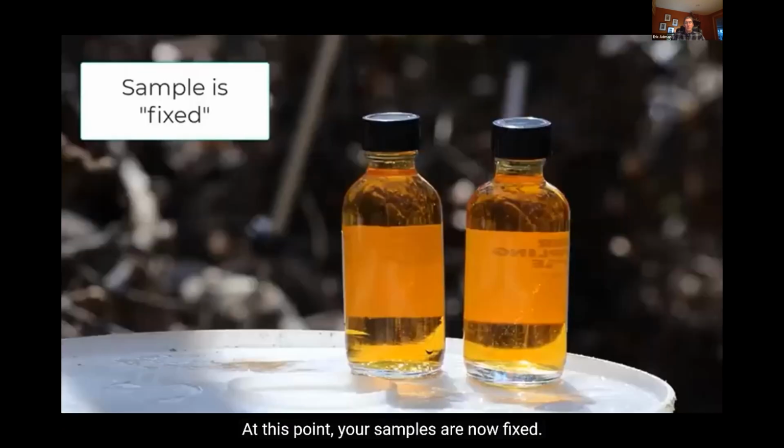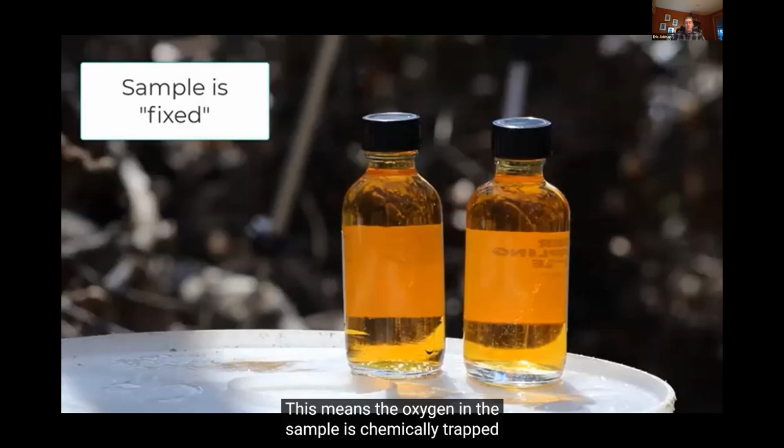At this point, your samples are now fixed. This means the oxygen in the sample is chemically trapped and that contact between the water sample and the atmosphere will not affect the test result.